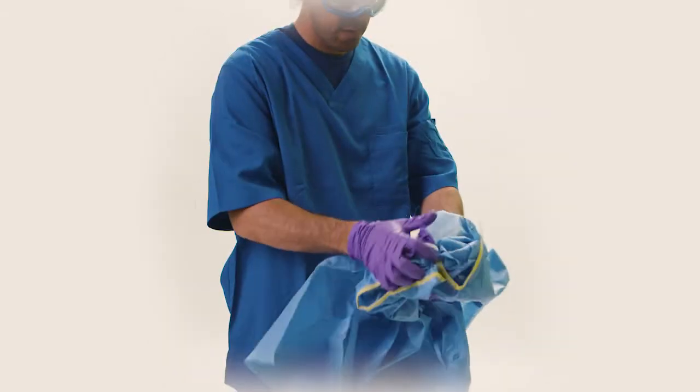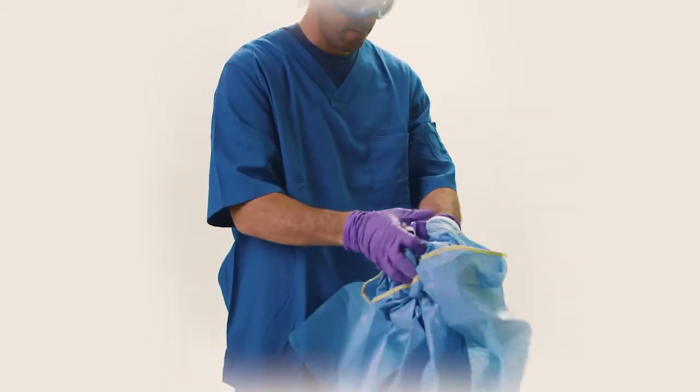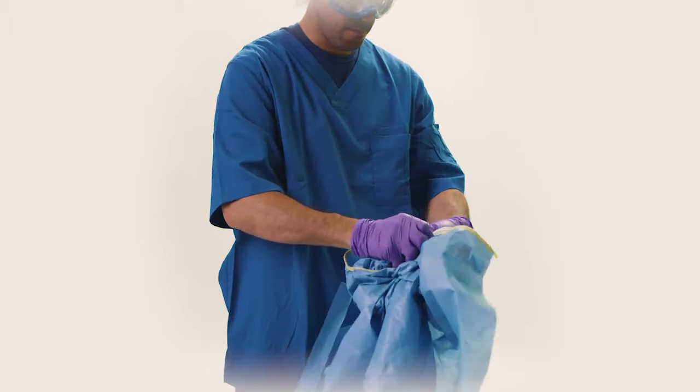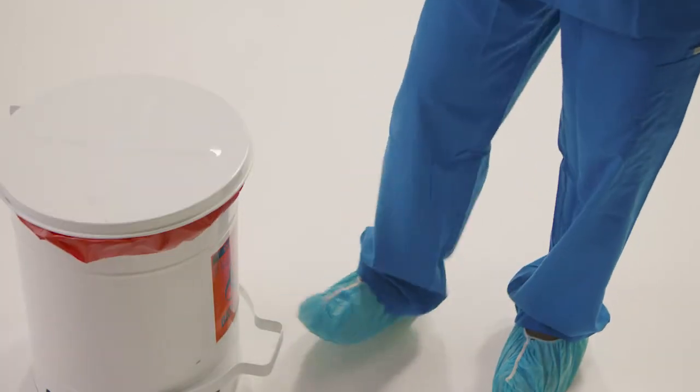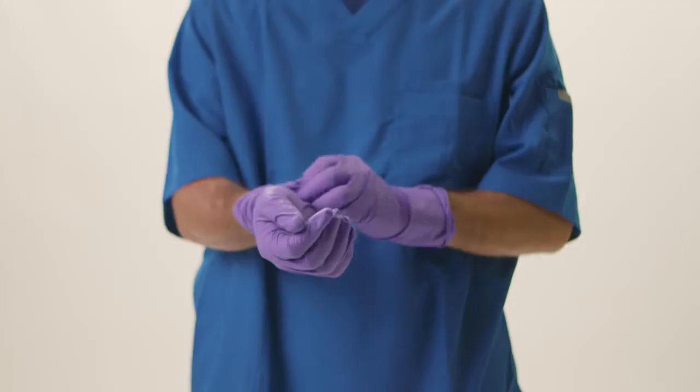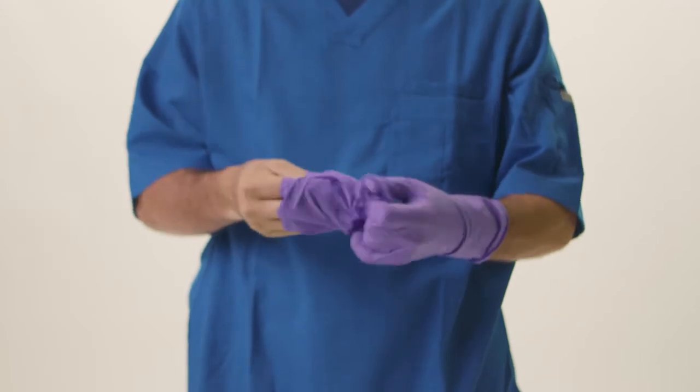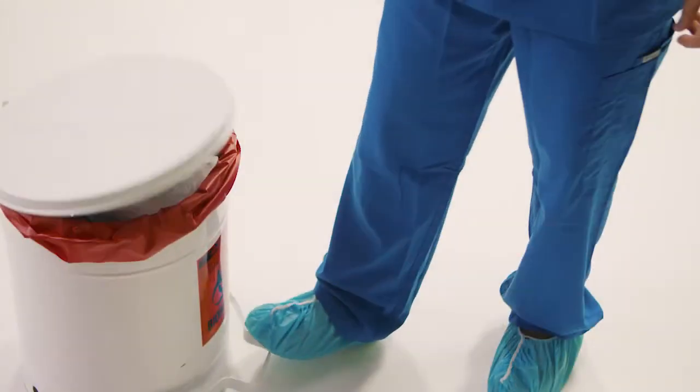With the sleeves of the gown rolled down, use the gown as a barrier layer and remove the outer pair of gloves. Roll the gown and outer gloves into a ball and dispose of them in a waste container. Remove the inner gloves and dispose of everything in the waste container.